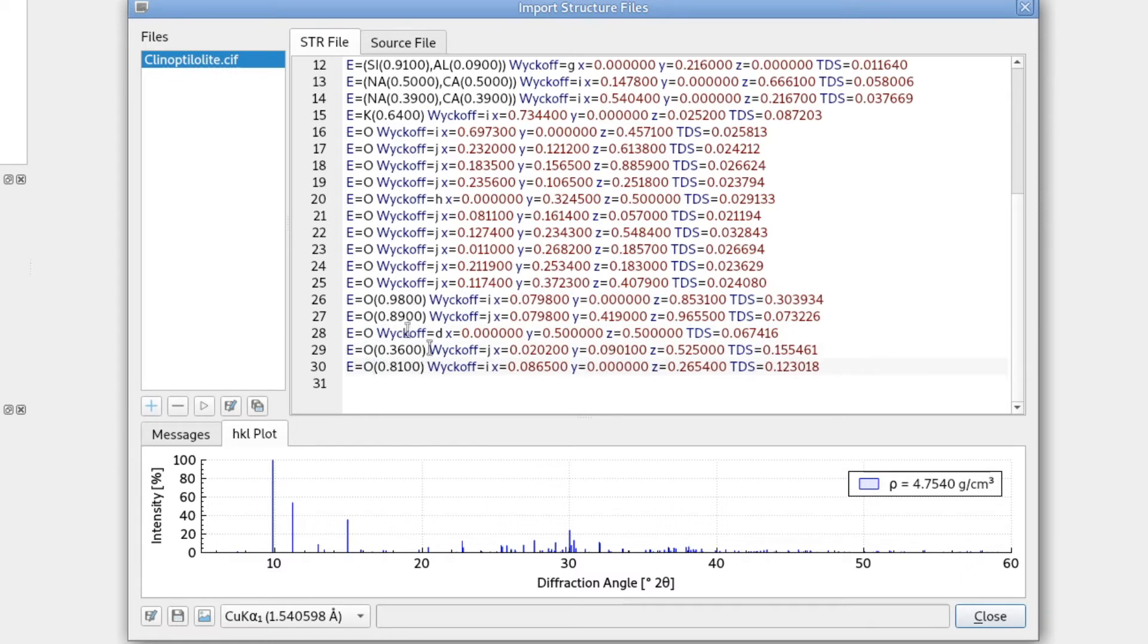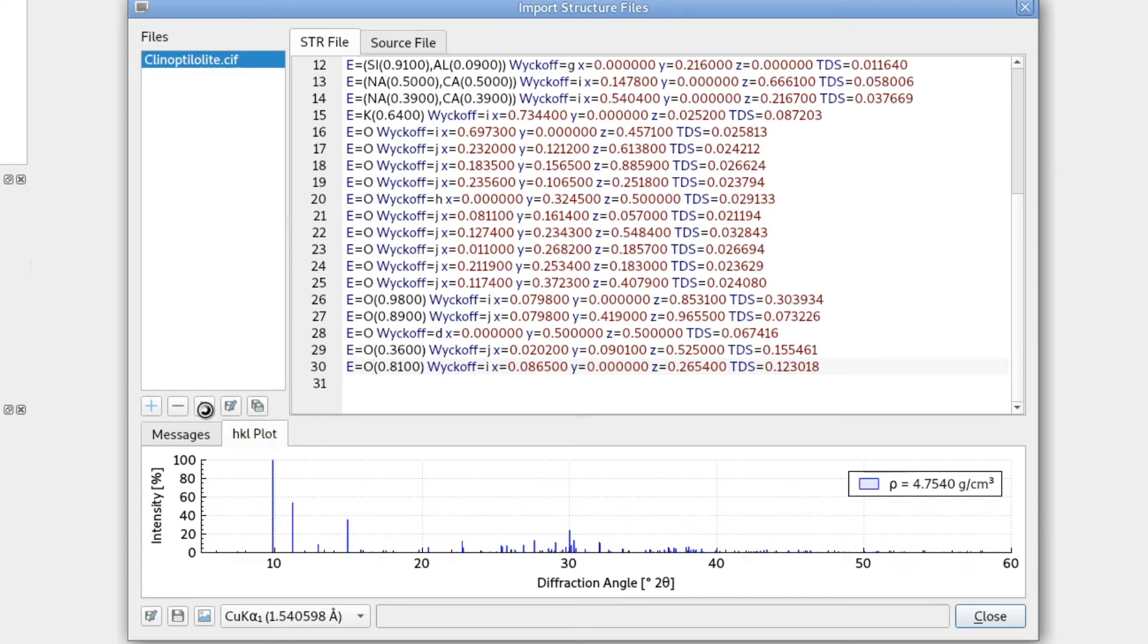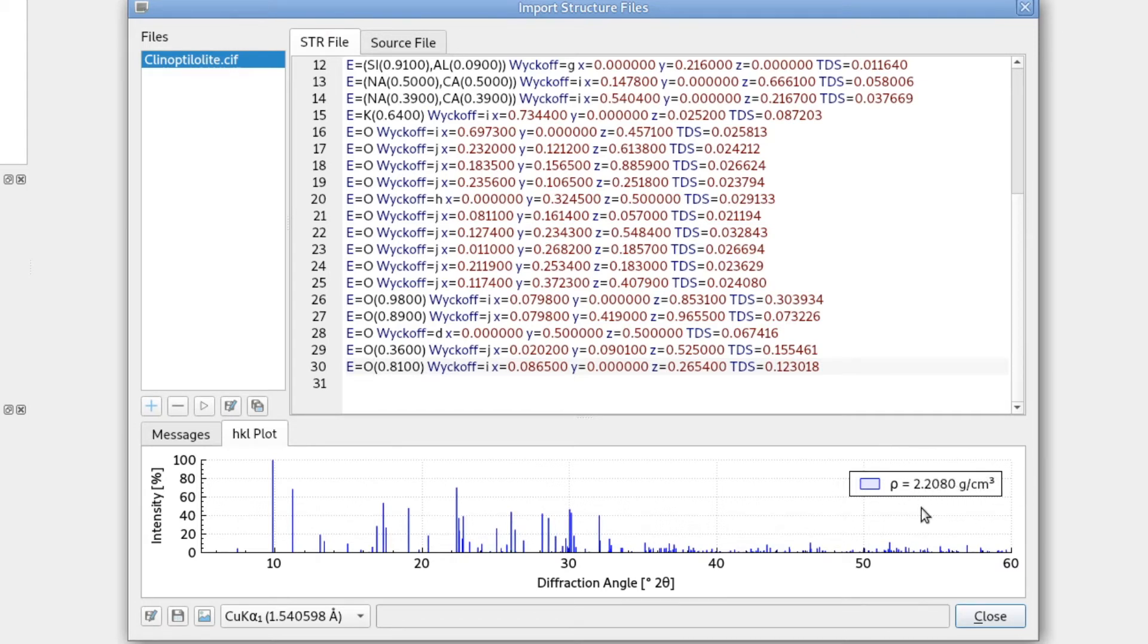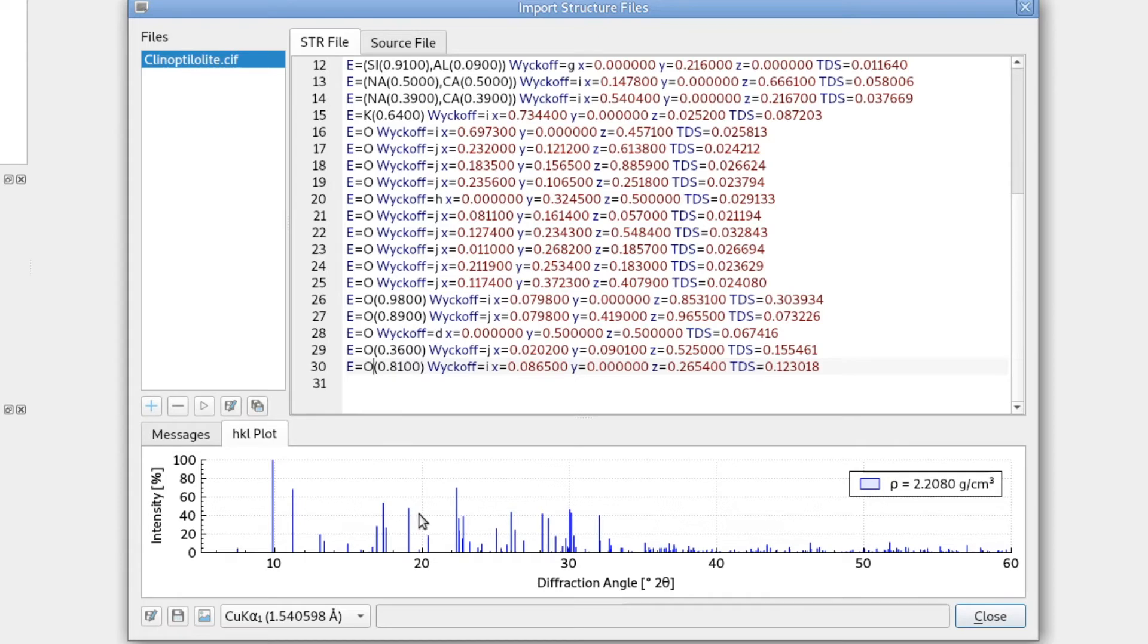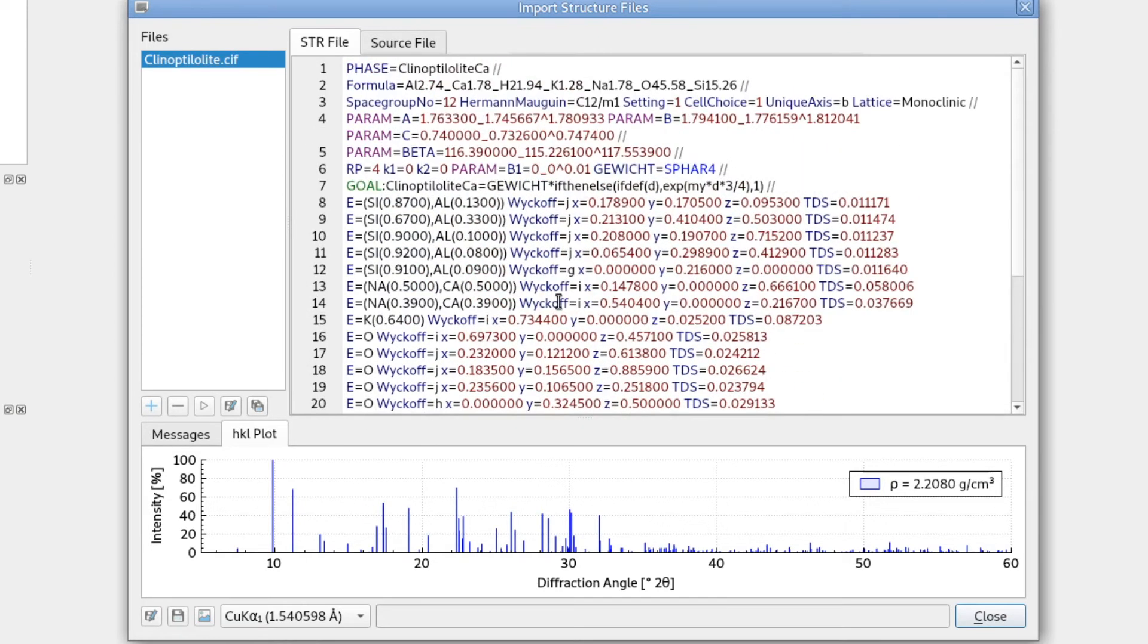And now we have to run the verification of this updated structure again. So we can press the play button here, run again. And now the calculated structural density makes a lot more sense for a zeolite. It's a bit more than two. And also the stick pattern, the HKL plot, changed quite a bit. So now this should be the correct structure.